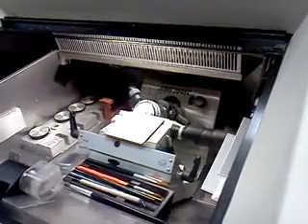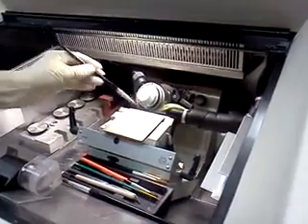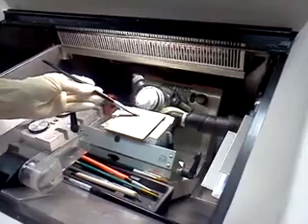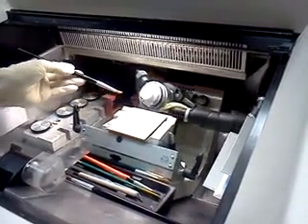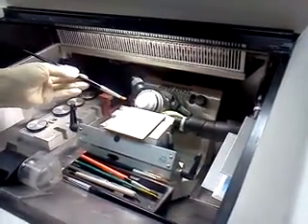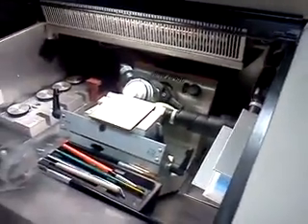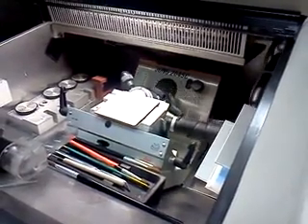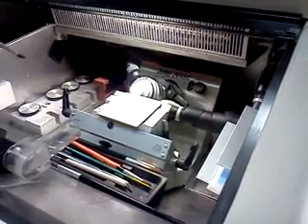There we go. Okay, so what you do when you start is you need to keep this clean. So we're going to keep cutting until we get a nice full piece. This is called facing the block.